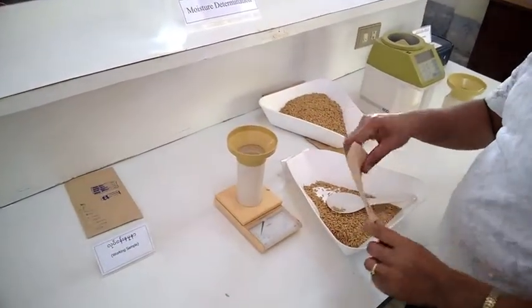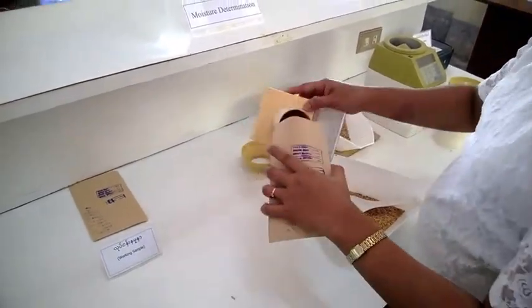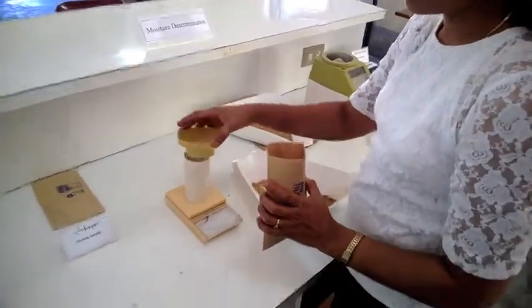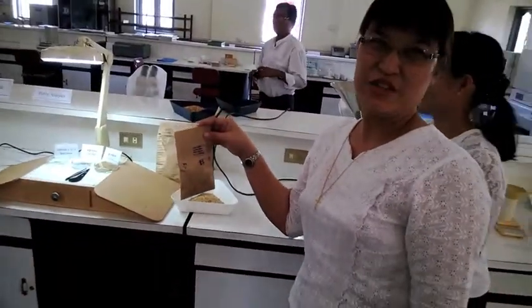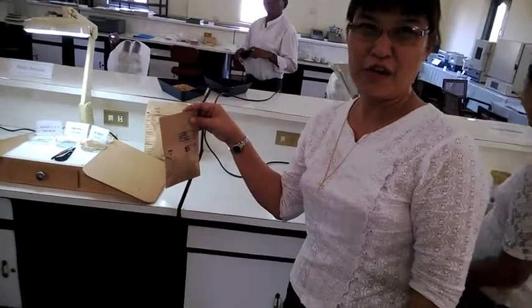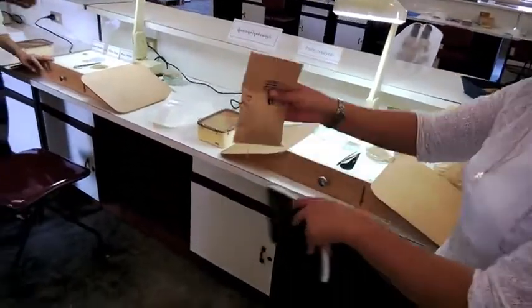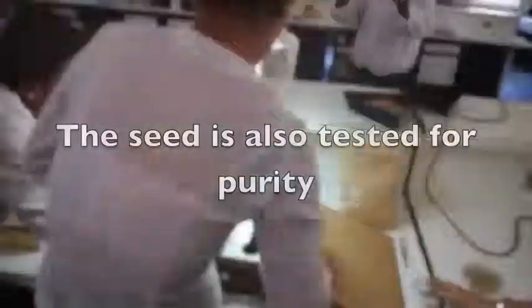This is 70 grams, measured as you see. Now take it and put it in the little bag. The next step will be two replications for the working sample. After that, our staff will do purity analysis.